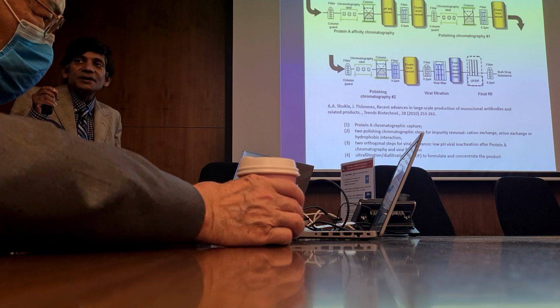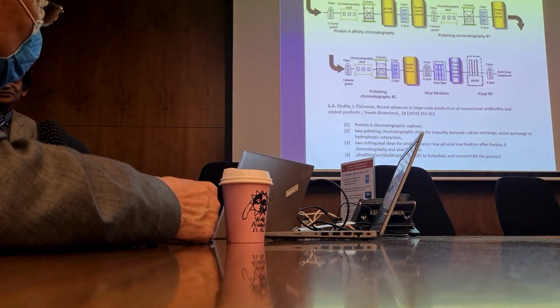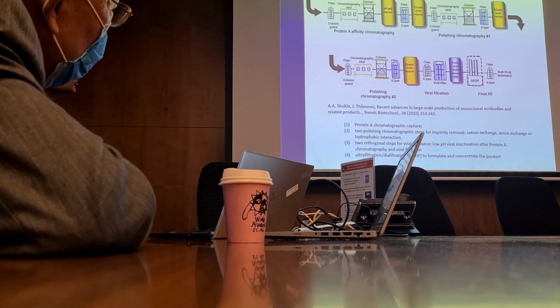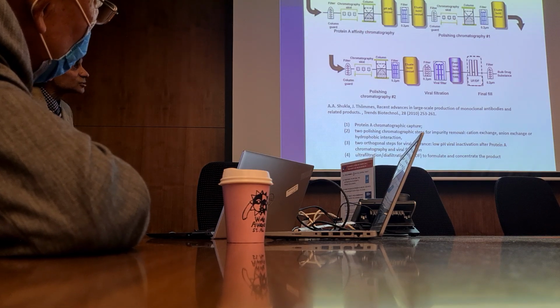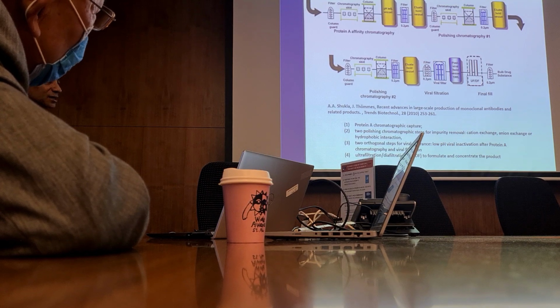One thing to remember in the biotech industry: all packed bed processes are called chromatography, okay? So we might call these adsorption, but they call them chromatography. This is called bind and elute chromatography. Protein A is the ligand. You bind your product of interest and you elute.